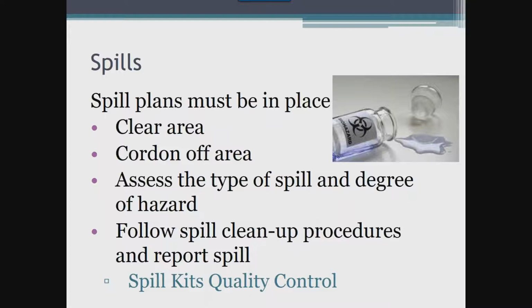An important note here is in regards to spill kits. Spill kits must be used as determined by the manufacturer. Additionally, you want to check your spill kit regularly to make sure that it is not expired or the contents within it are not expired. If the spill kit does not have an expiration, there must be a record kept of the date the kit was put into service, and its usability must be assessed with this assessment documented on a periodic basis.